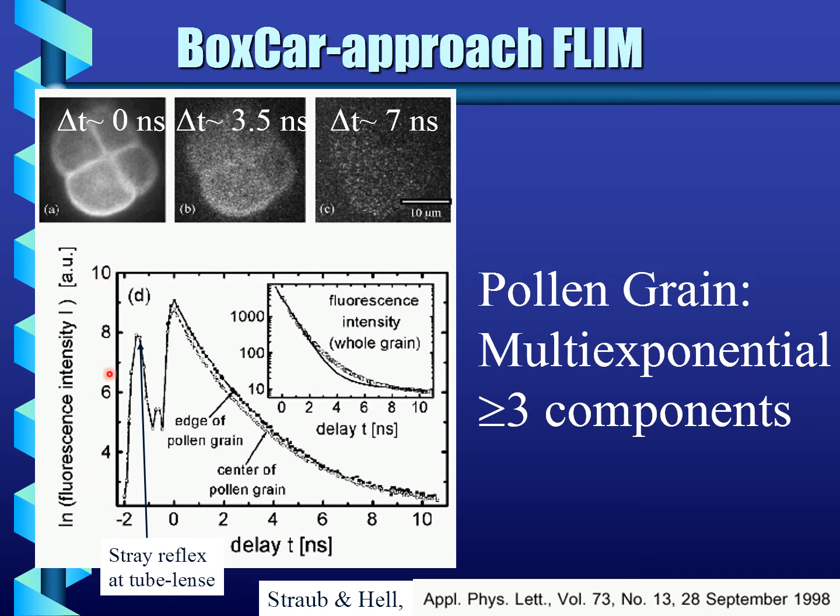So you've actually measured this over orders of magnitude in brightness, going from something very bright right after excitation down. You also see that there are other problems here. Before the actual lifetime measurement, you get stray reflexes from the tube lens and so on. Because the tube lens comes before your sample, the reflex will appear earlier than the actual start of the curve here, and therefore it's not really disturbing your measurement if you know about it. You just make sure that you start your fitting somewhere here, or if you dare, you can include the instrument response function of the system and start really at 0.